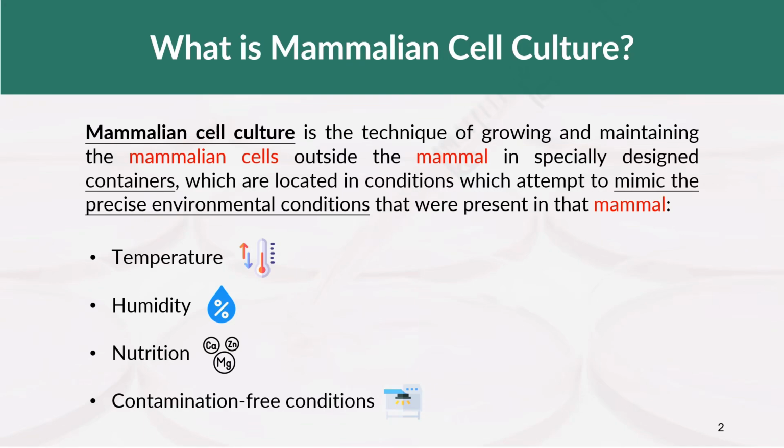So this includes controlling factors such as temperature, humidity, pH, oxygen concentration, nutrient availability, and definitely a contamination-free kind of environment.